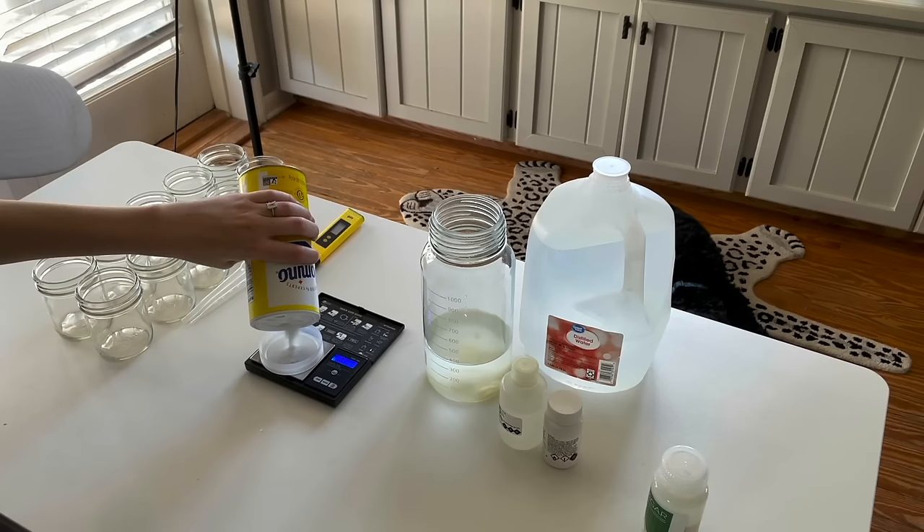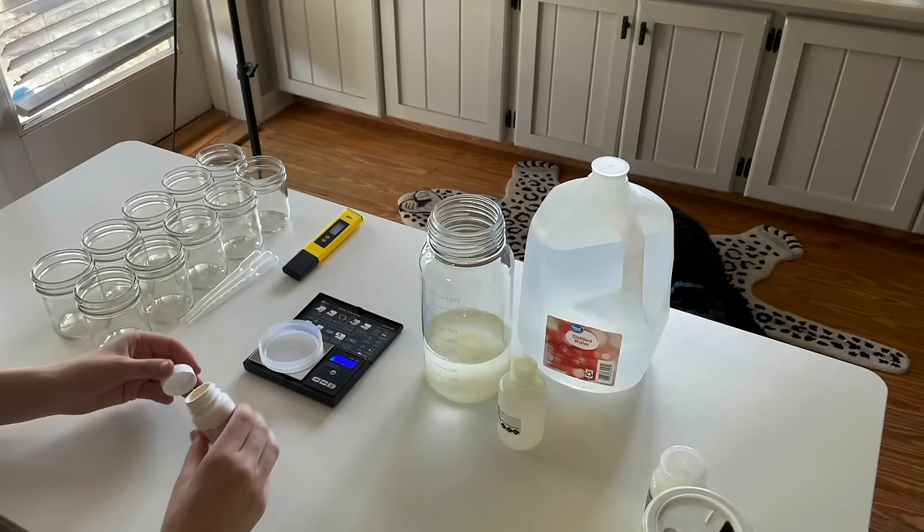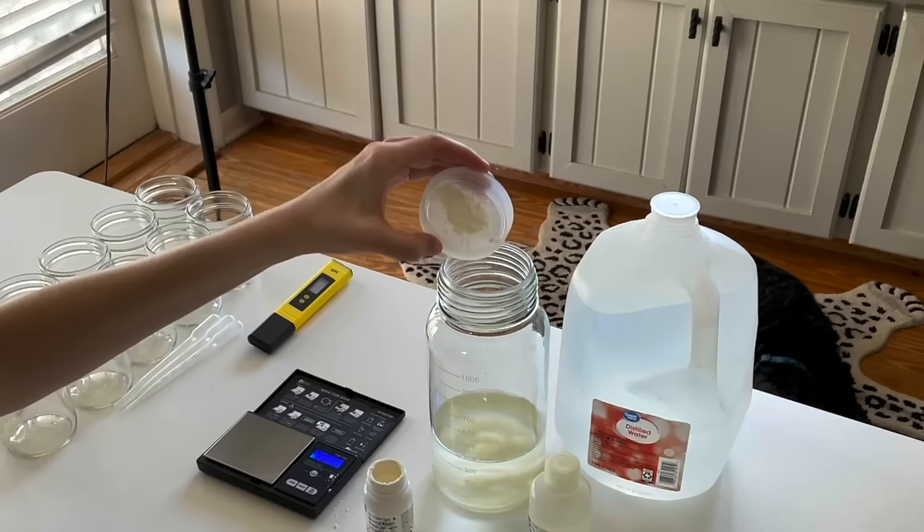I also add 15 grams of sugar and 2.27 grams of Murashige and Skoog, which is sold as a powder. A lot of times the protocol won't give you the exact grams of MS to add, so in that case just refer to what is printed on the bottle.